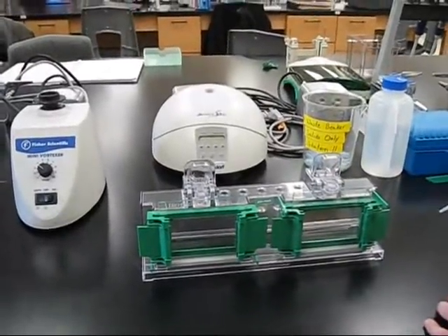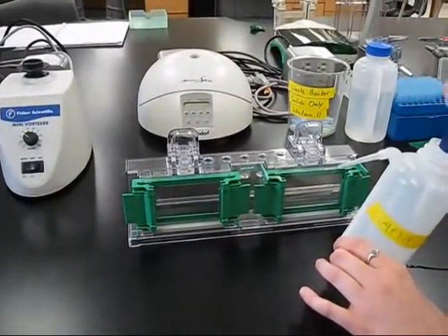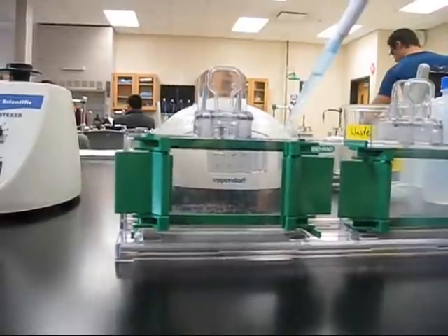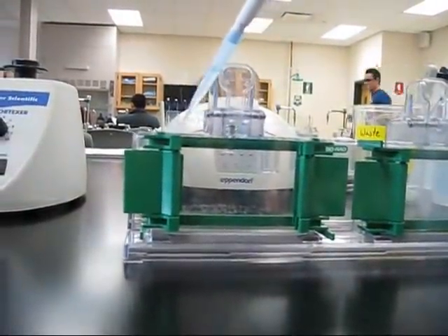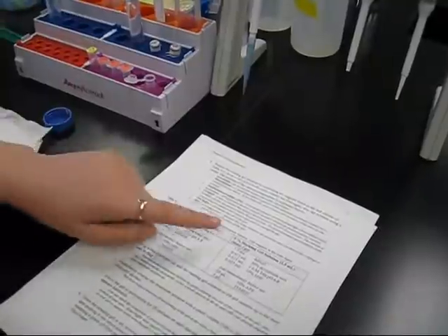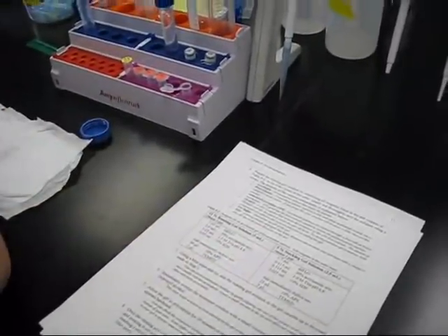Immediately overlay the monomer solution with a small volume, 100–200 µL, of isopropyl alcohol. Once this has been completed, allow the gel to polymerize for 20 minutes or until the residual gel in your sample tube appears hardened. Make your stacking gel according to Table 9-2 on the right hand side. Do not make your stacking gel too early, otherwise it will solidify.